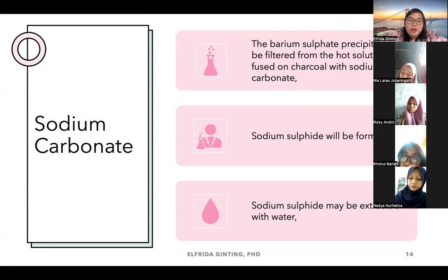Now, the sodium sulfide here, you can extract it with water, meaning that the sodium sulfide will mix with water.